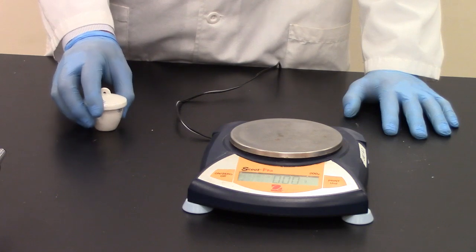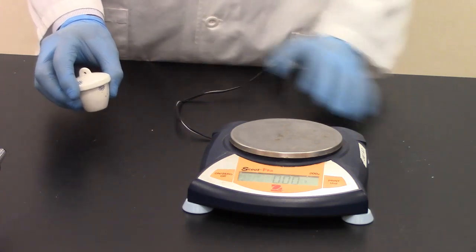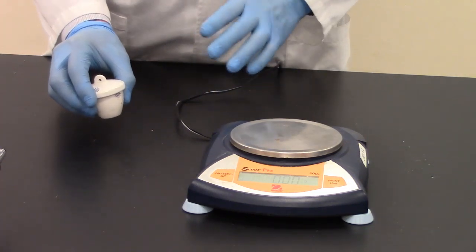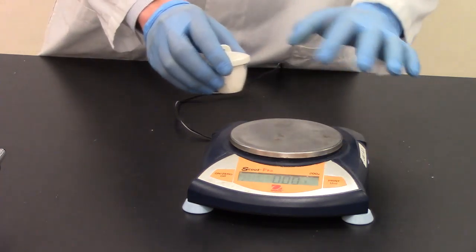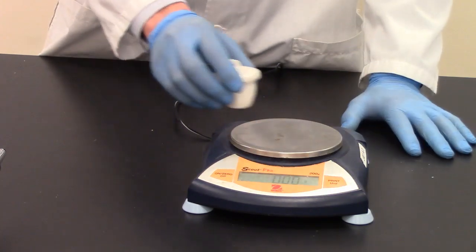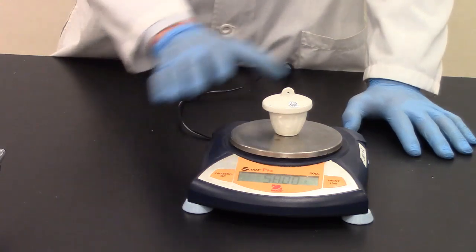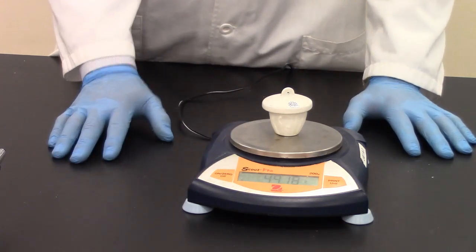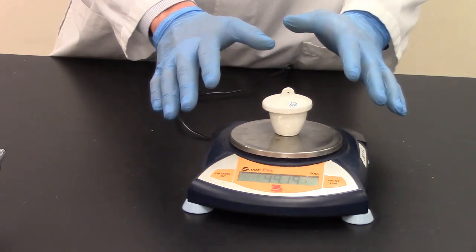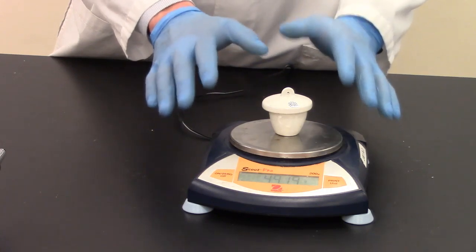And then once you realize that it is cool to the touch or maybe a little warm but not hot, go ahead and take it over to the balance. I'm going to zero this out and then get a mass. Now when I mass it out the second time, this is the mass of my crucible and the product, the solid product.